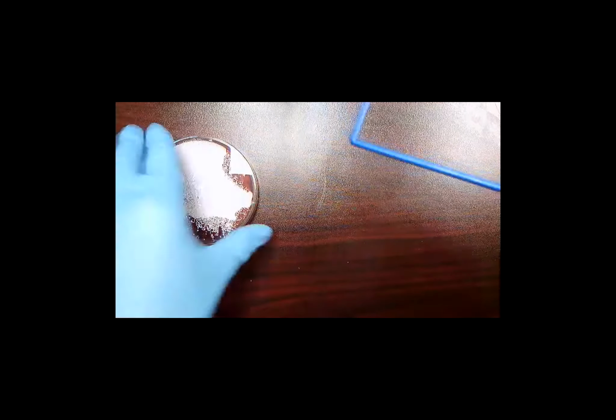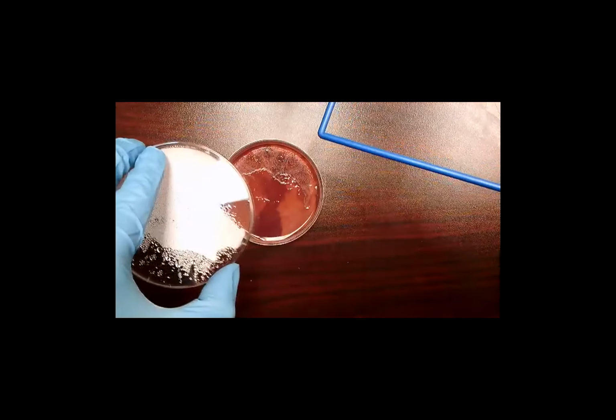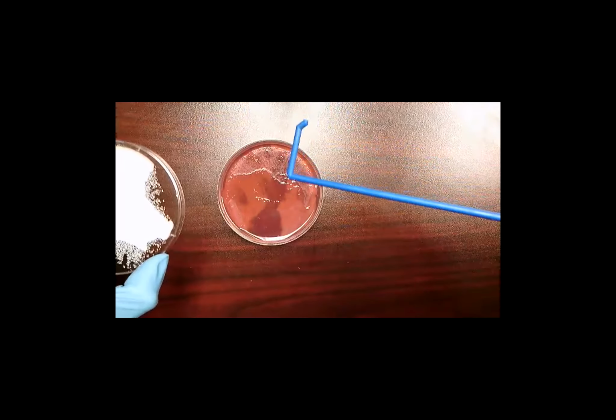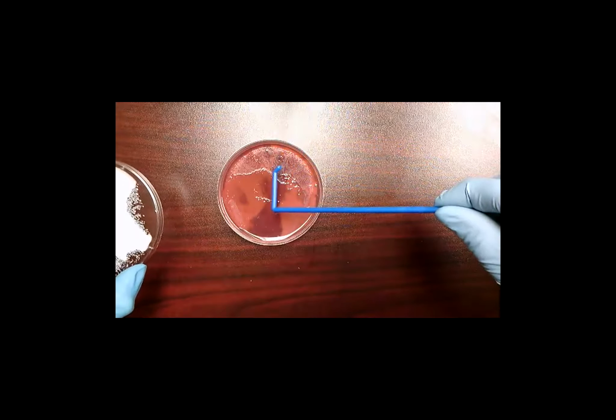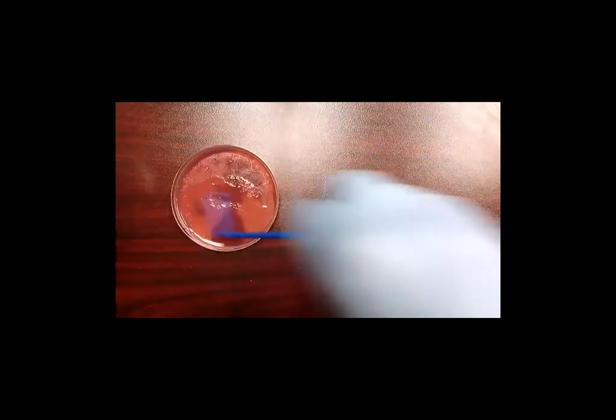Take one out, try not to touch anything. Then you take your lid. Well, I would just hold your lid upright with your hand. But if you wanted, let me show you two ways. If you hold it upright, you put the hockey stick spreader in the center, and you just start going back and forth through the whole thing.